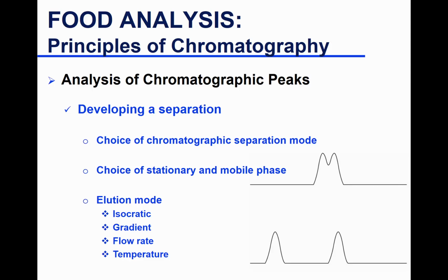That's the first thing you want to do. Look at what's published in that area. What have people done before you? You'll find hundreds and hundreds of articles related to determining carotenoids in different grains. Somebody has looked at it before you. Almost 99% of the time, somebody has done this before. There is a method that is established. Sometimes there is a standard method of analysis. So that's the first thing you want to go do. I'm going to look for research articles or standard methods to determine what method would work best for me to determine carotenoids in my grain sample.